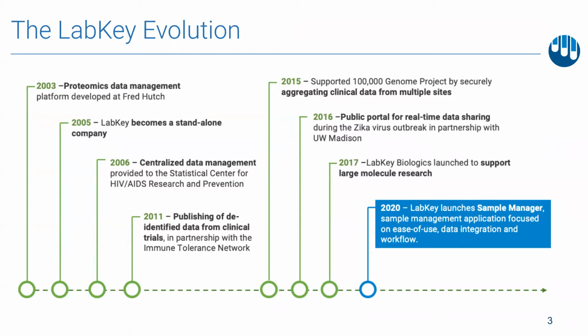They continued expanding by creating a scalable, centralized data management tool for the SHARP consortium, capturing and integrating study data. LabKey then continued to improve the study module for ITN by providing the ability to publish and share de-identified clinical trial data. During this time, LabKey started supporting other scientific data types such as flow cytometry, NAB, Luminex, and other general assays.